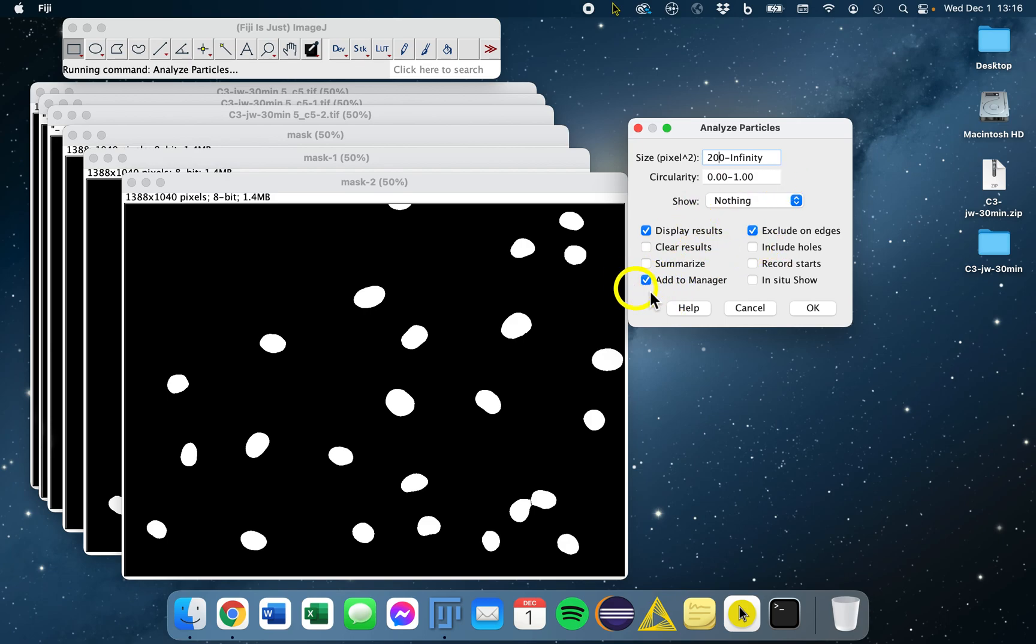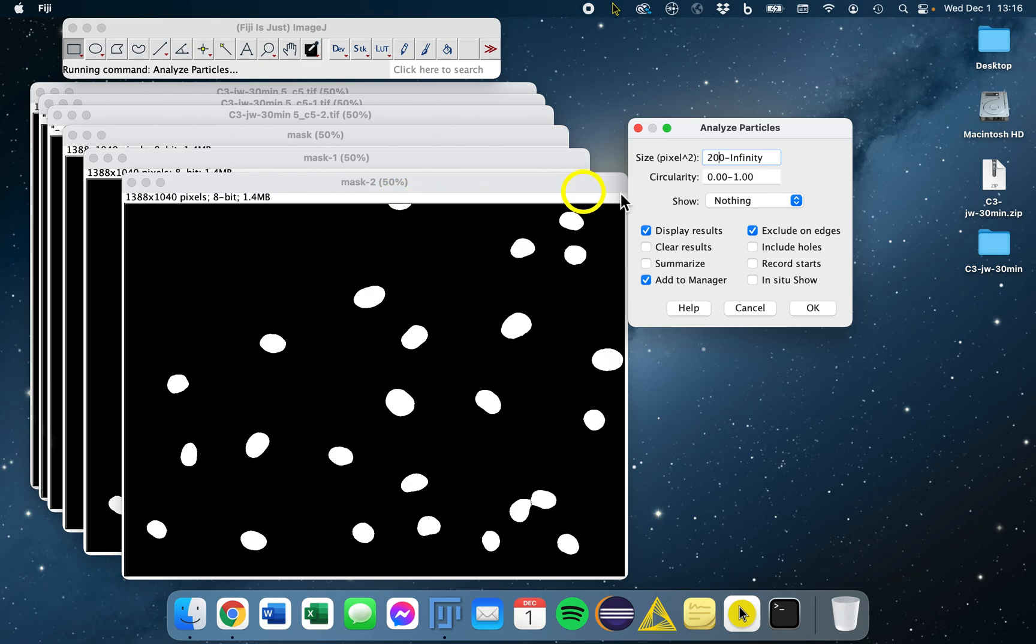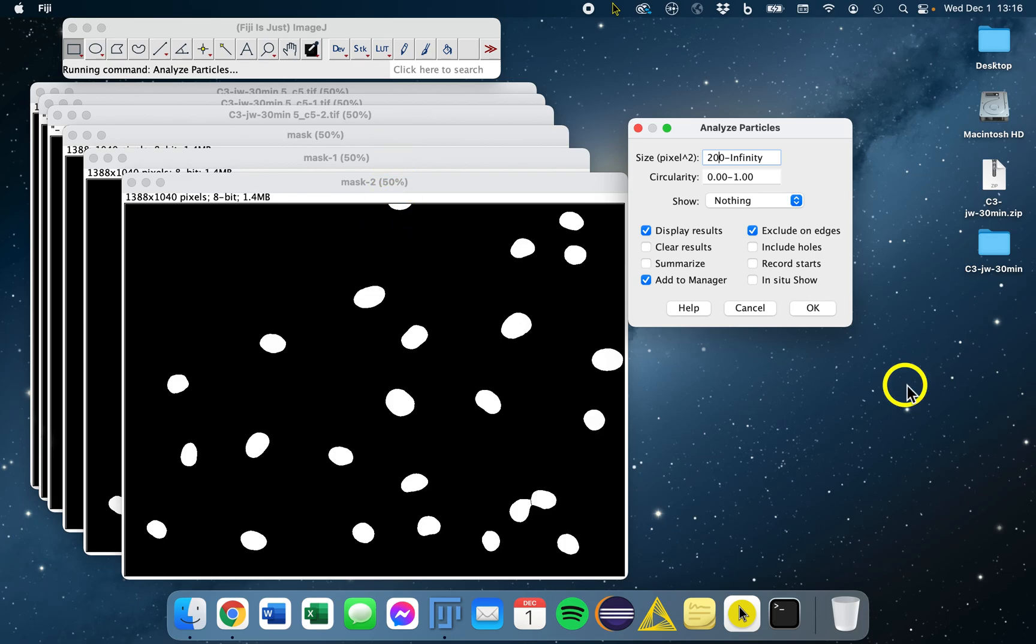We're also going to add our objects to the manager, display the results, and we're also going to exclude any objects that are on the edges. Any of these objects that you see touching the edges, we kind of want to ignore because we don't know exactly what's happening on the other side of this.